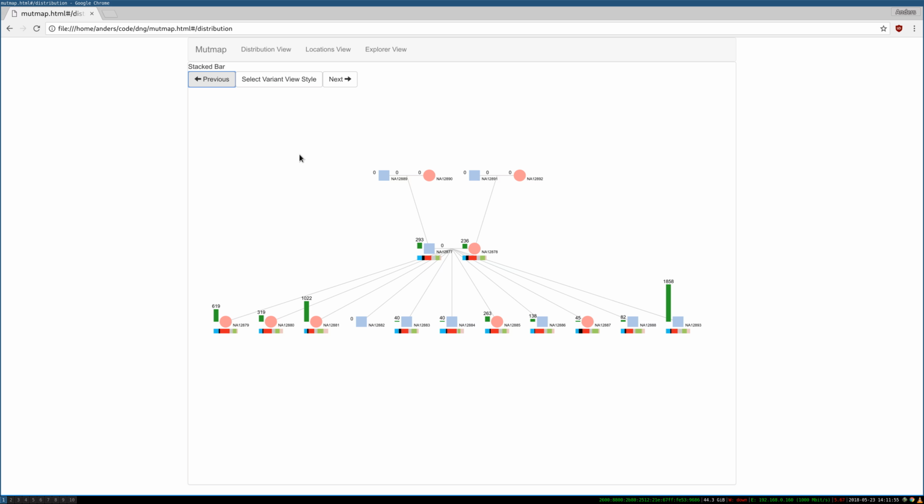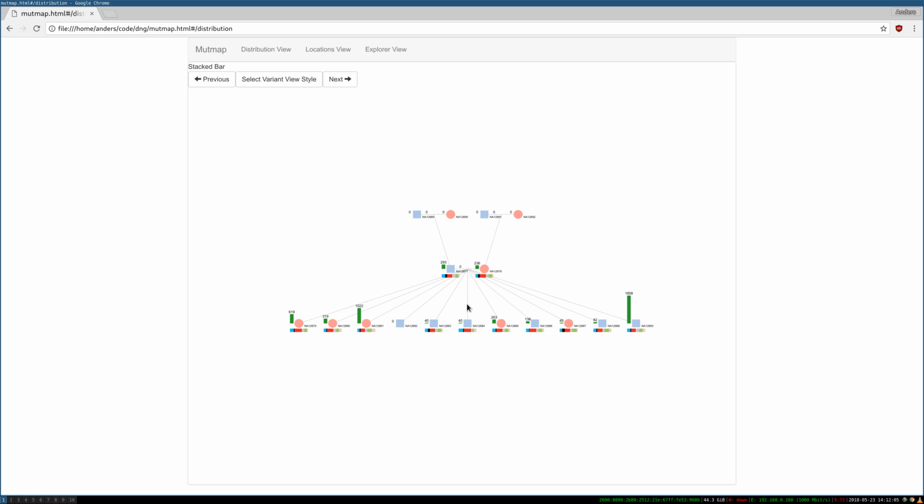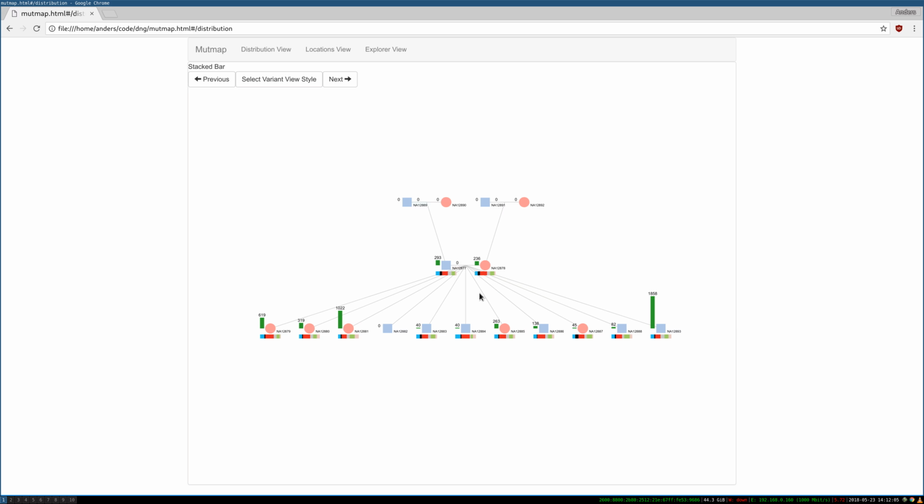So that's a quick overview, just some of the features we have. Obviously, this is still a very early prototype. We need keys in here for the colors. We need tooltips and things to help explain how to use this. And we just have to narrow down which views are more valuable. So we're at the stage right now where we're ready to start getting more user feedback and figuring out what tools and views are useful for getting actual work done.